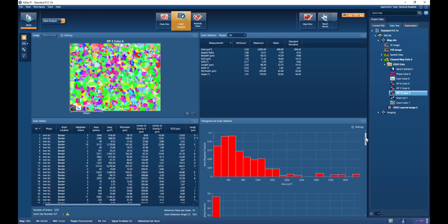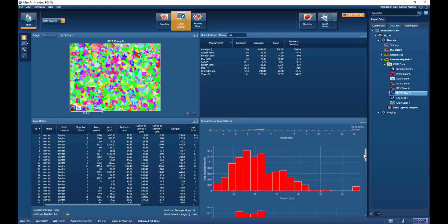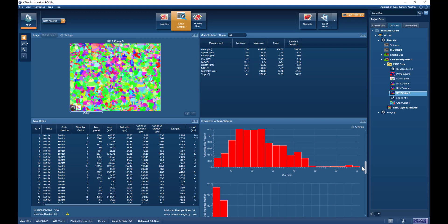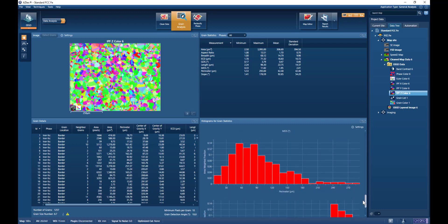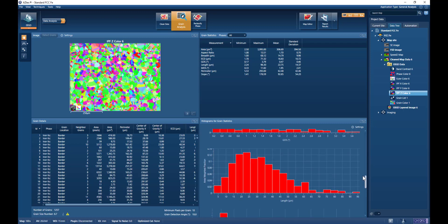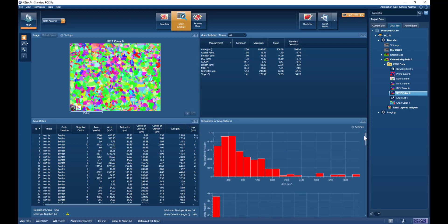We can also see the distributions of a number of the different parameters, as shown by scrolling down this slider in the bottom right-hand corner. We can do very quick and easy grain size measurements within the Aztec platform itself.